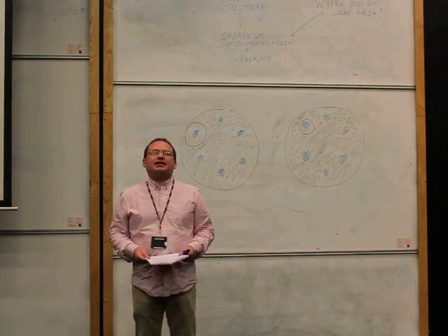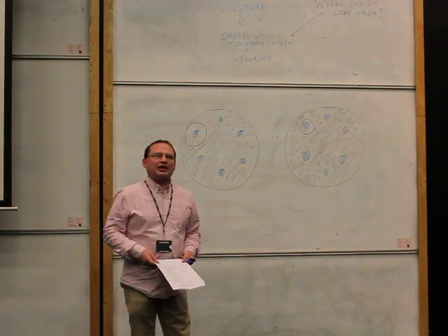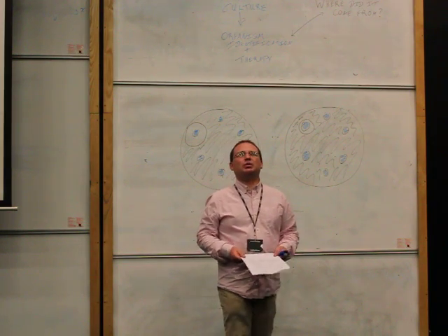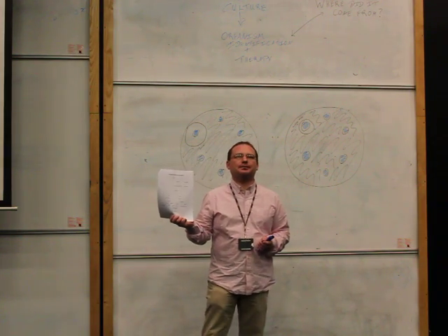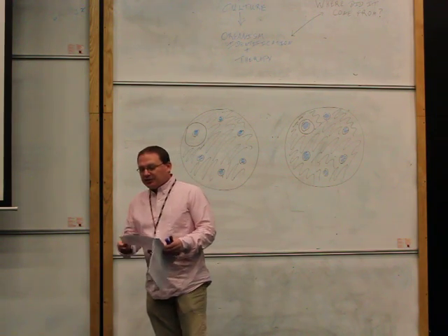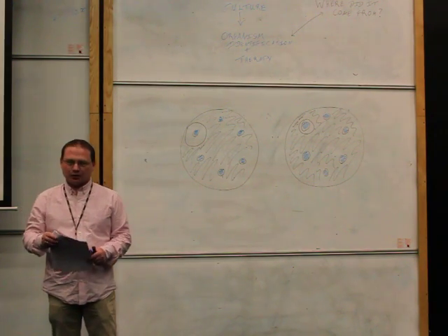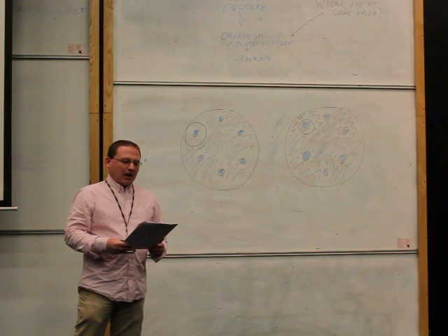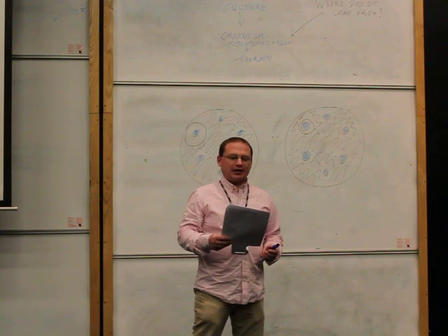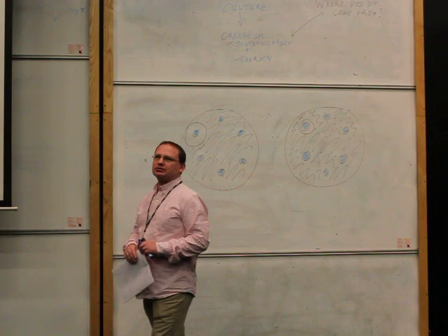And then it is a case of simply going through the flowcharts. There are videos which we'll be able to look at which will give you the answers to the tests that you will be looking at in this flowchart. Which brings me to one thing. Flowchart A for your Gram-negative organisms. We will be very kind to you and let you know that the organism, when you get to it, is motile.